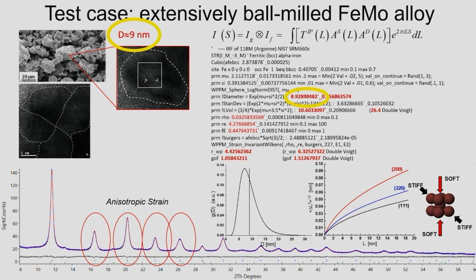So for iron, stiff main diagonal, soft cube face. Fluoride was the reverse, the opposite. So it is not a small feature, something you might miss. If you use this approach, you see this immediately, which is good. Tells you what kind of anisotropy is your material.